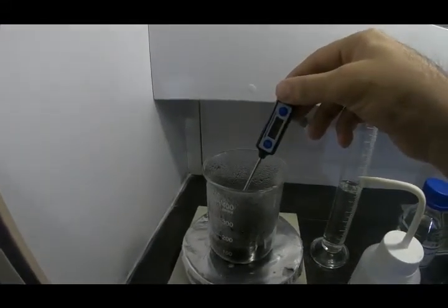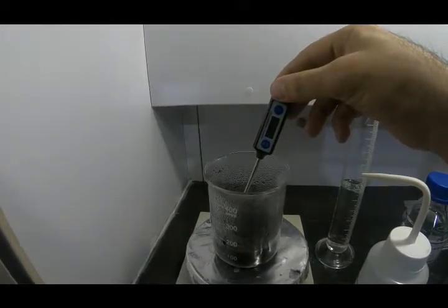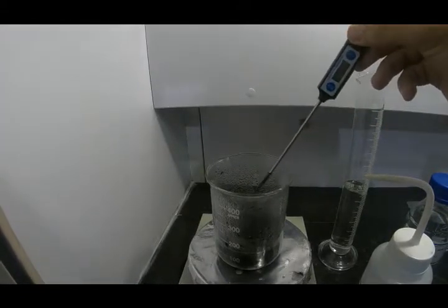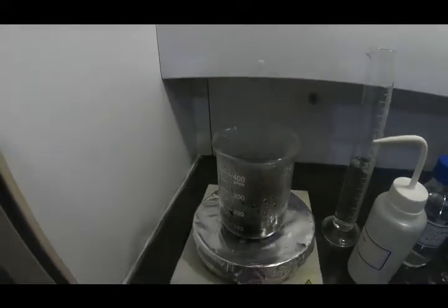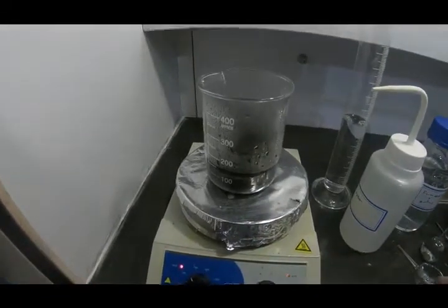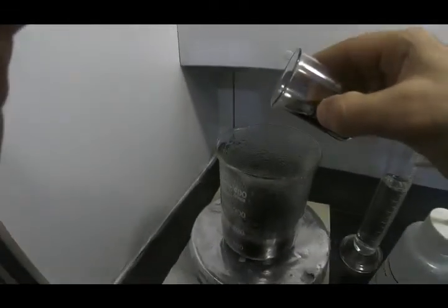Okay. The temperature is around 78 and it is pretty much constant, and it is just enough for our purposes. So I'm going to add the palladium chloride solution to the carbon and let it stir for about 2 hours. But first I'm going ahead and crank the stirring a little bit up, and then we can go ahead and add the palladium to the carbon.